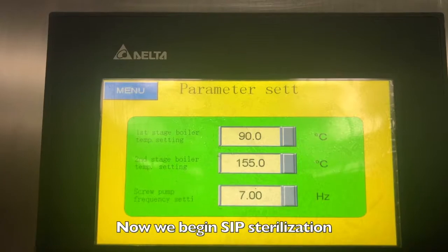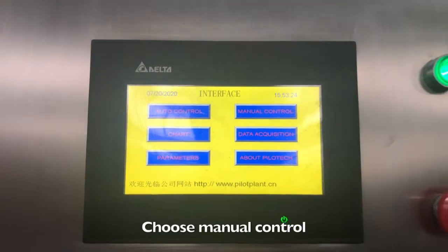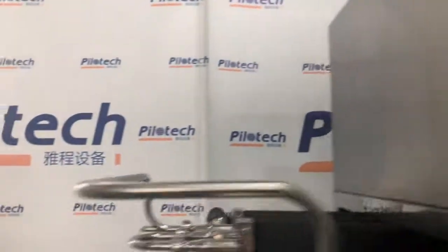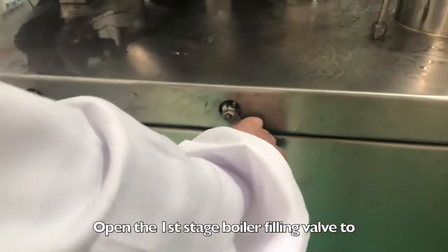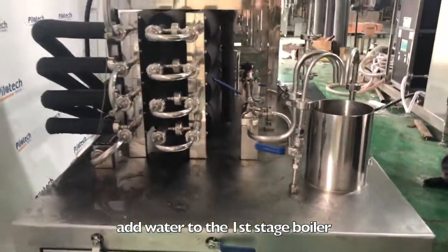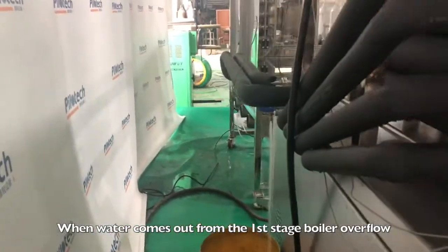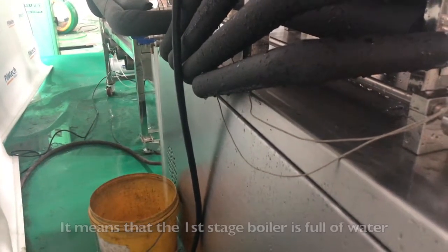Now we begin SIP sterilization. Click Menu. Choose Manual Control and start the screw pump. Open the first stage boiler filling valve to add water to the first stage boiler. When water comes out from the first stage boiler overflow, it means that the first stage boiler is full of water.